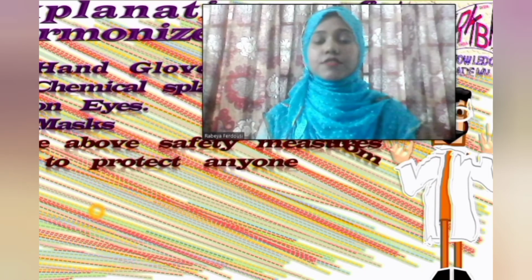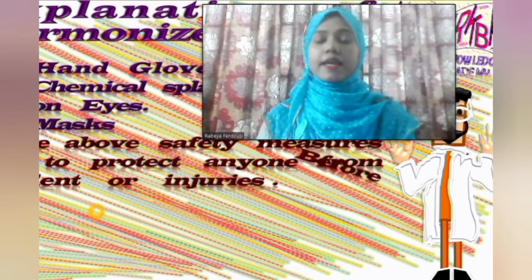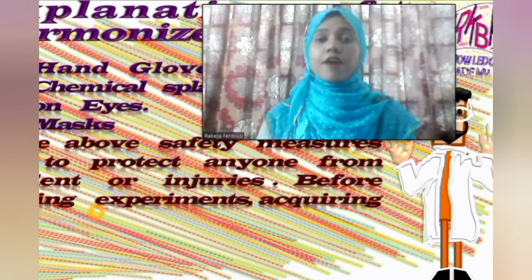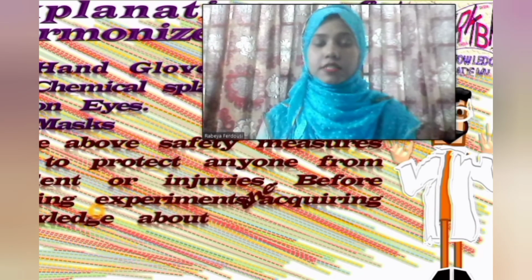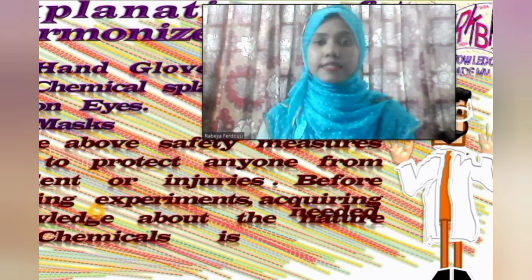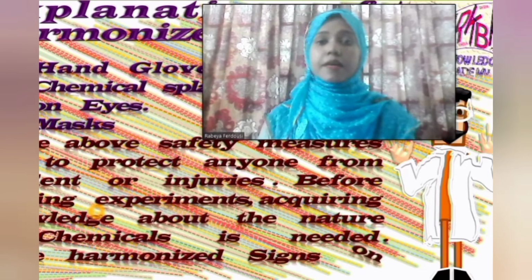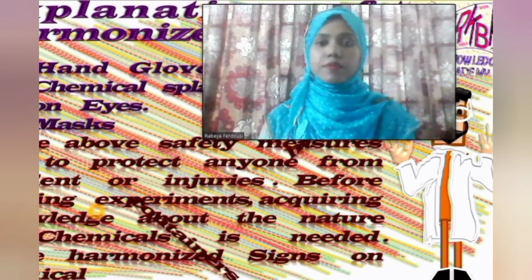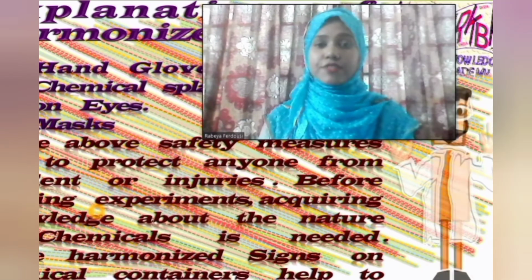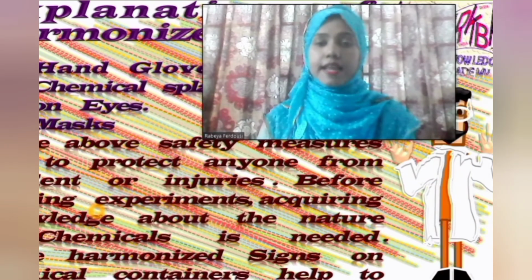And the final one is masks. We know that in a chemistry laboratory there remain very poisonous gases which are evolved with various types of chemical experimentations. Due to the presence of these gases, anyone may suffer from headache, tears of eyes, or even vomiting. That's why using masks is very important in a laboratory. In my slides, I have added names of these 4 safety measures which may protect anyone from accident or injuries in a laboratory.